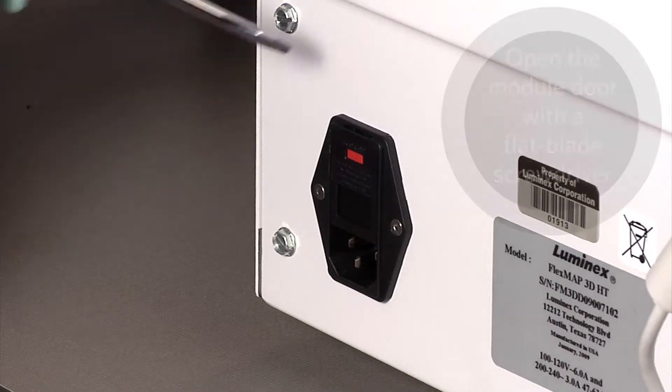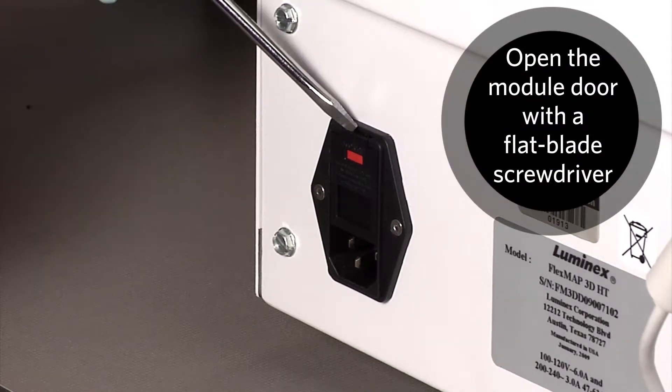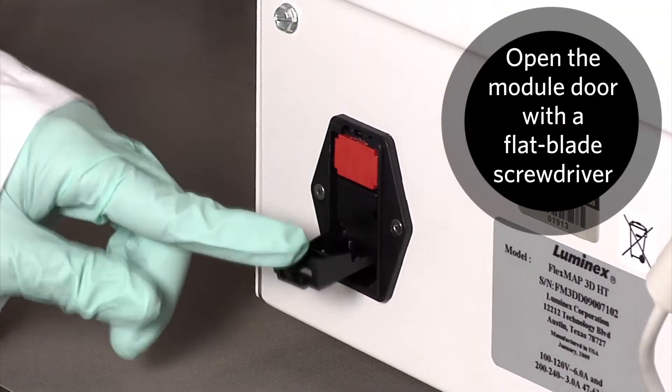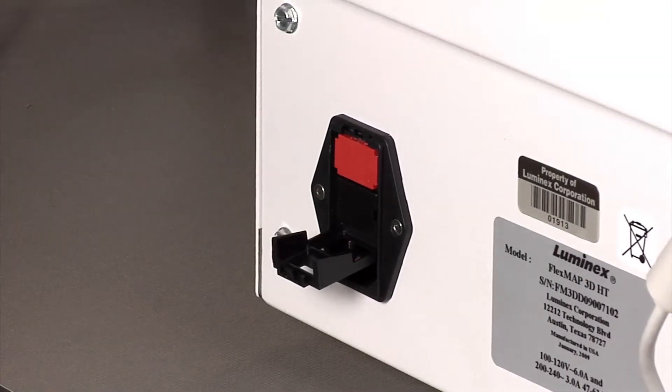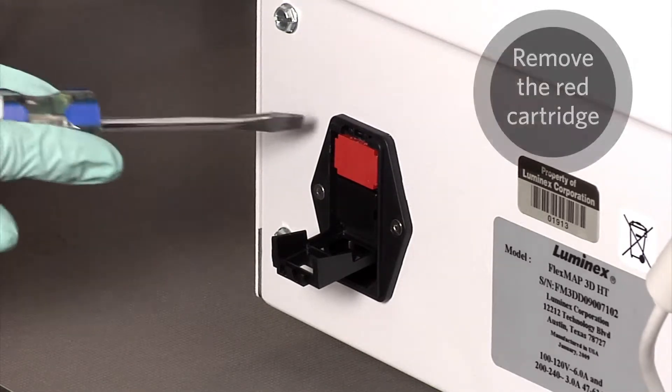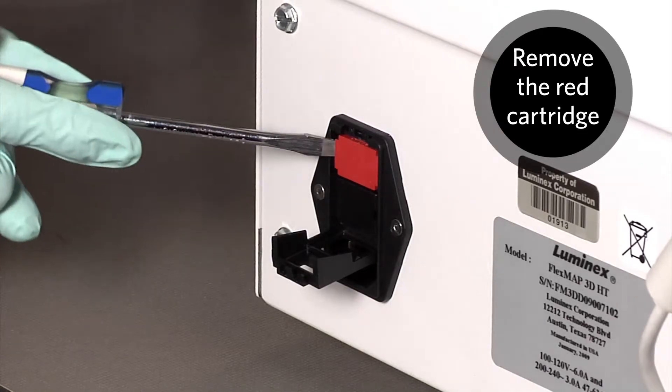Use a small, flat blade screwdriver to open the module door on the lower left corner of the back of the instrument. The door opens downward. Locate the red cartridge behind the door. Use the screwdriver to remove the red cartridge.